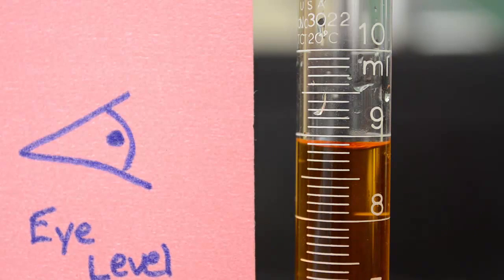So here we are. First thing we're going to do is take a look at the first digit. So we are between 8 and 9. The liquid level, you can see the little meniscus, the little dip, is between 8 and 9. Because we are between 8 and 9, we would read this as 8 milliliters. We know that there's 8 milliliters, no more, so our first number would be 8.